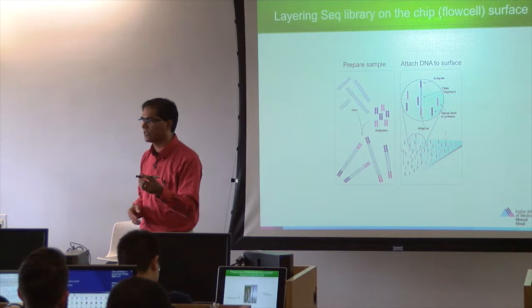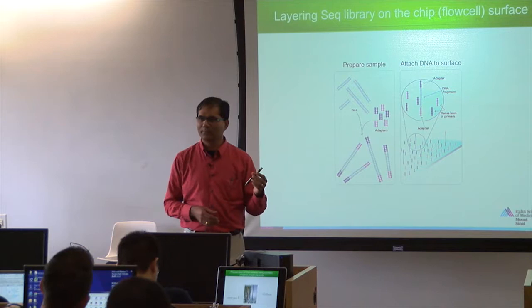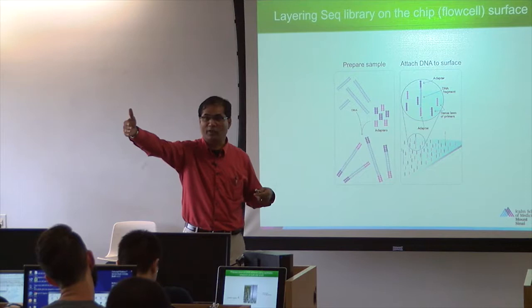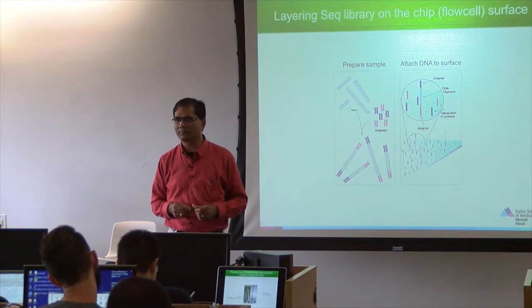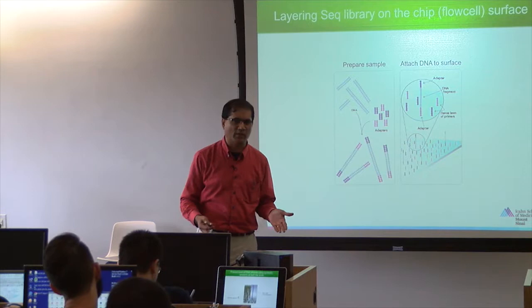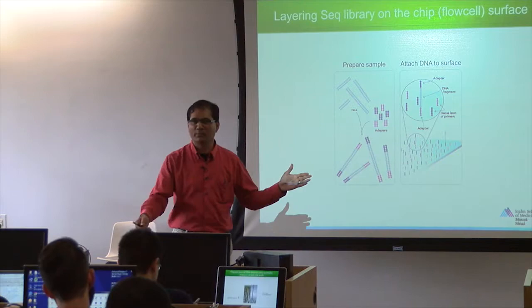Cool, simple. And then they have created the machine which can have 16 of these slots, 16 human genomes. How much time does it take? 1 week. Compared to 13 years and $2.7 billion, right? How much does it cost? It costs something between $1,500 and $5,000 nowadays. Right? So that's how we moved from 2005 to 2016.